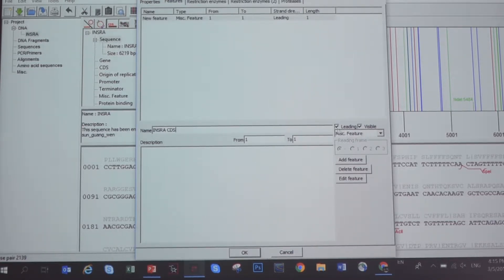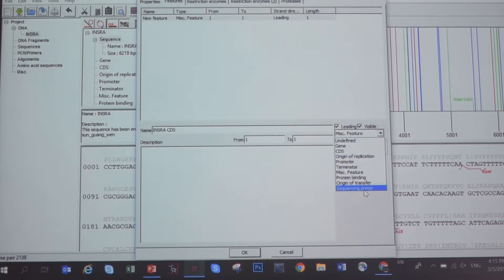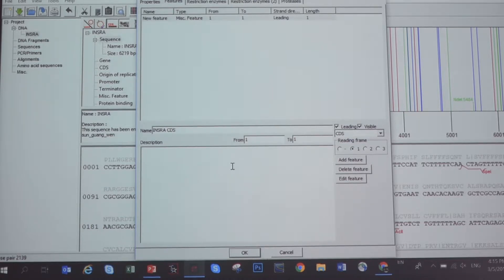The sequence is on the top strand, so we call it the reading strand, and the type of sequence is coding sequence. For the reading frame, for the moment just choose one. After that, you need to define the exact region — copy the start and end numbers.